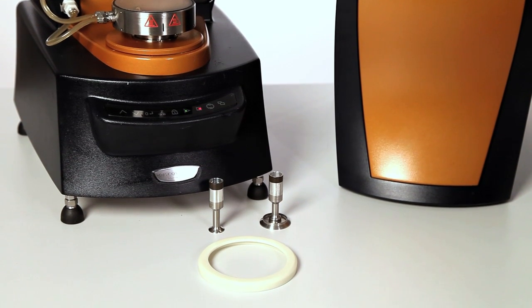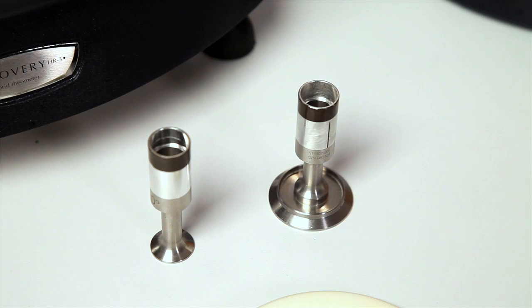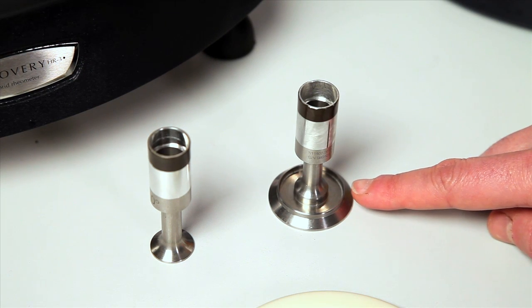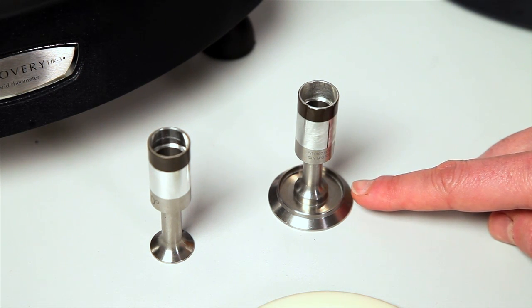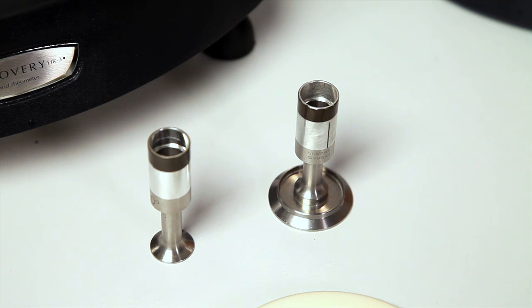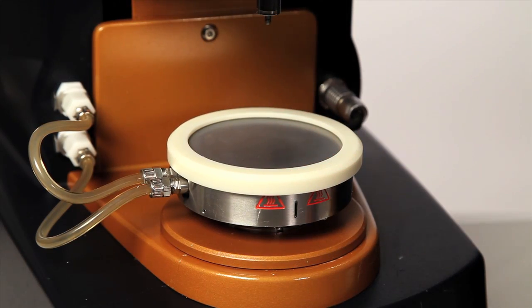Using the solvent trap is very easy. First, you must choose your geometry and make sure it has the solvent trap well. Then you fit the centering ring on the Peltier plate.